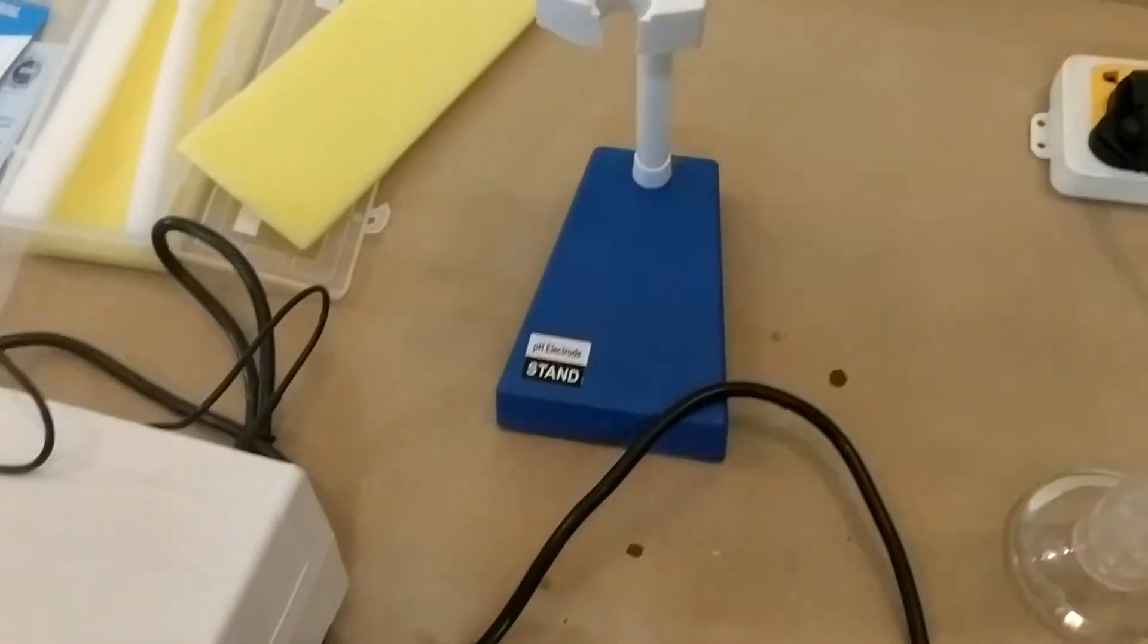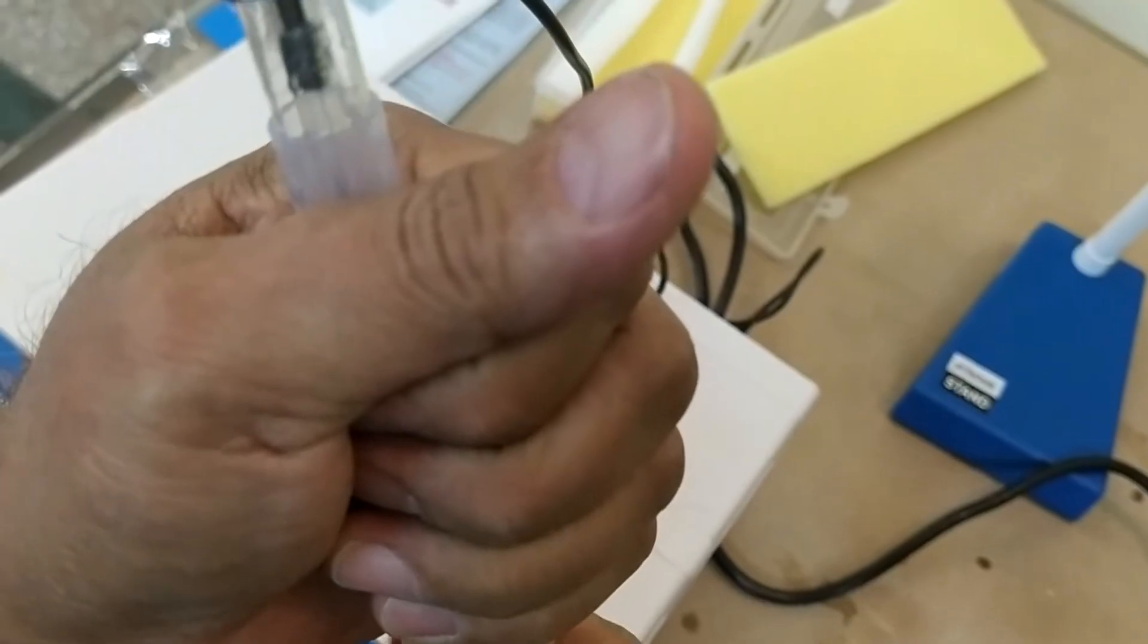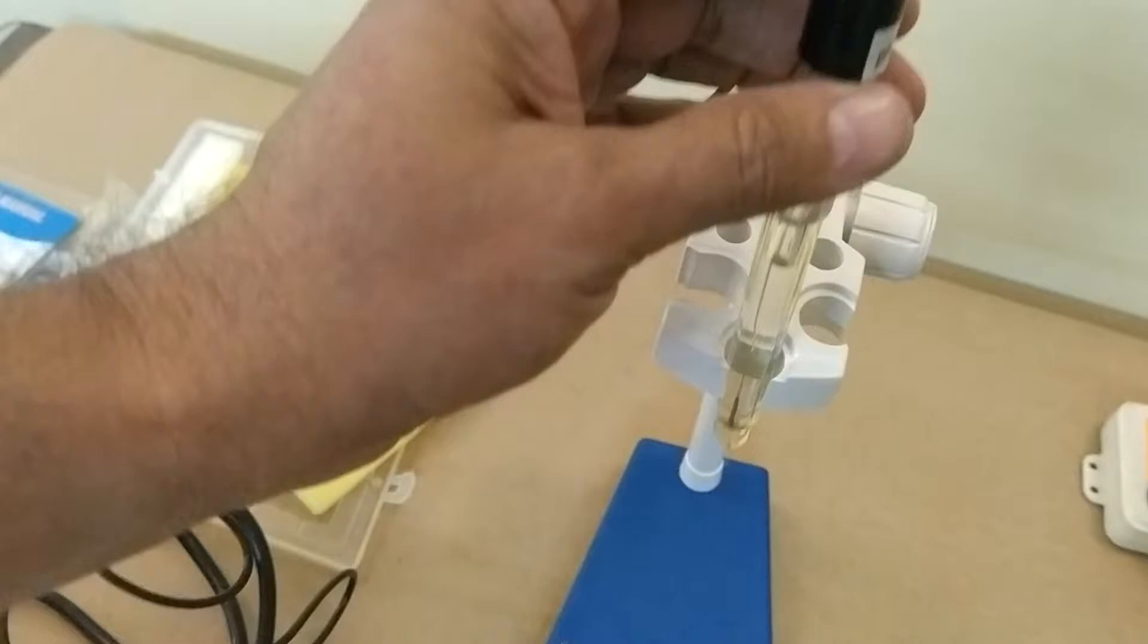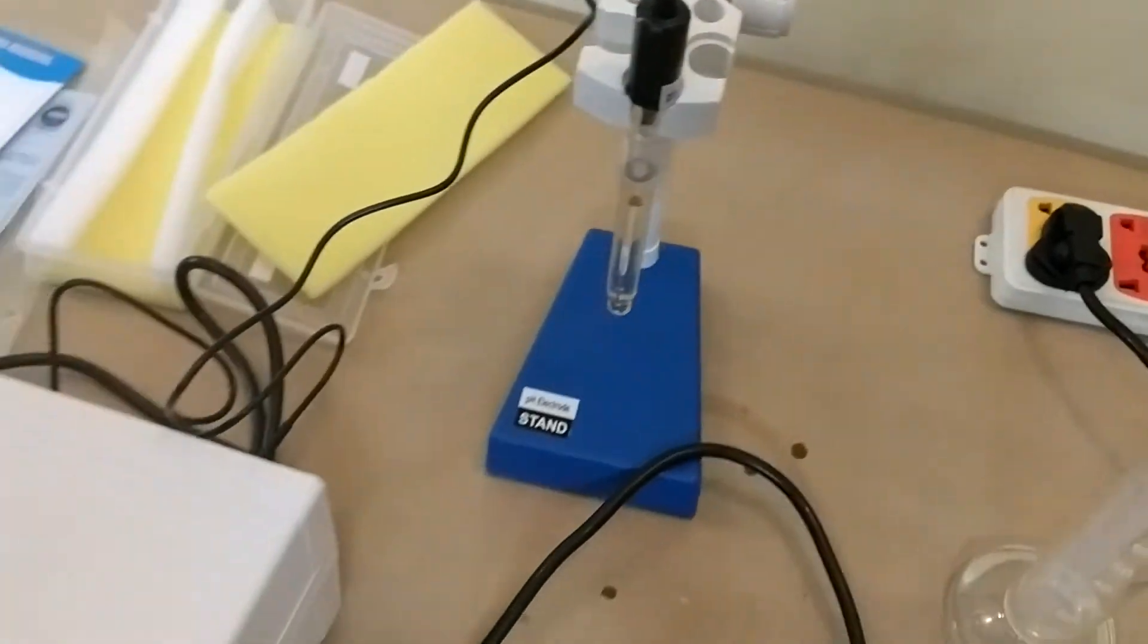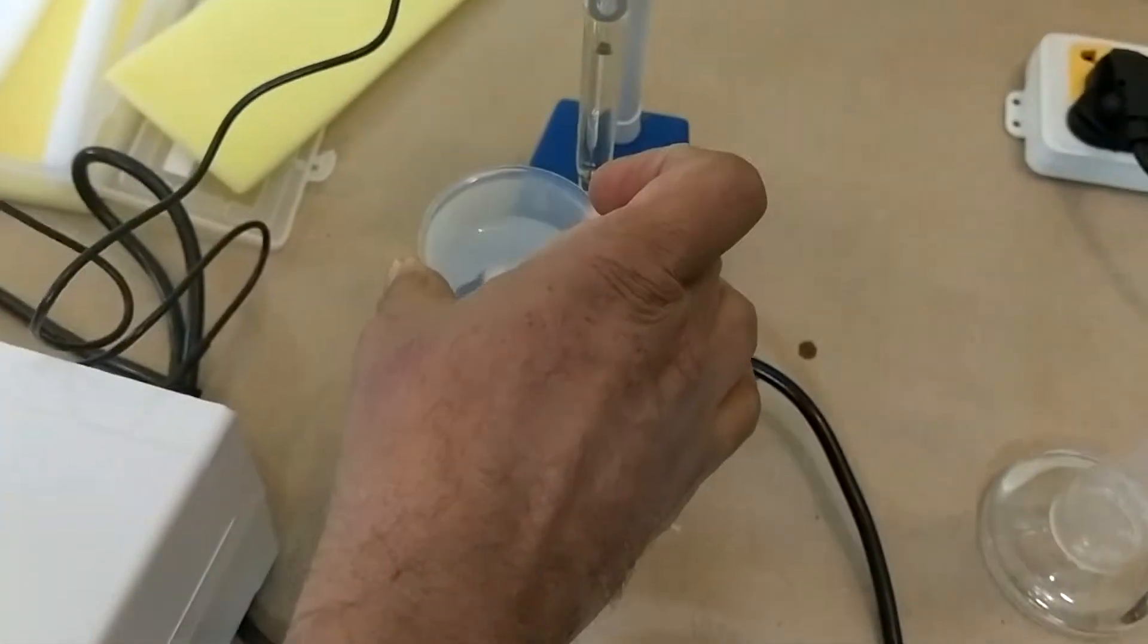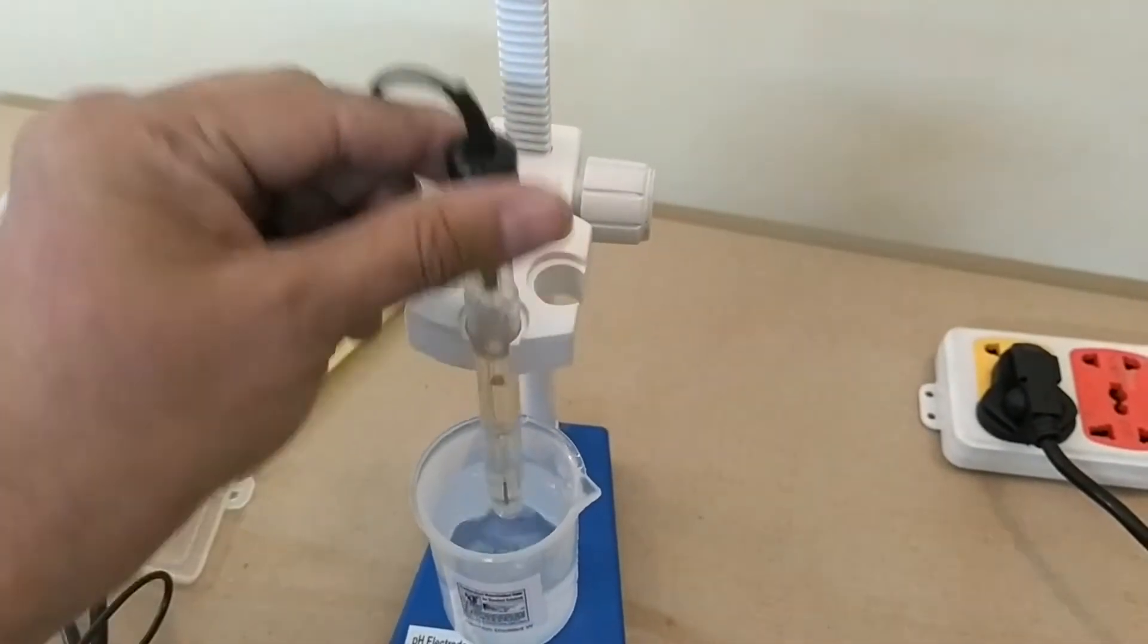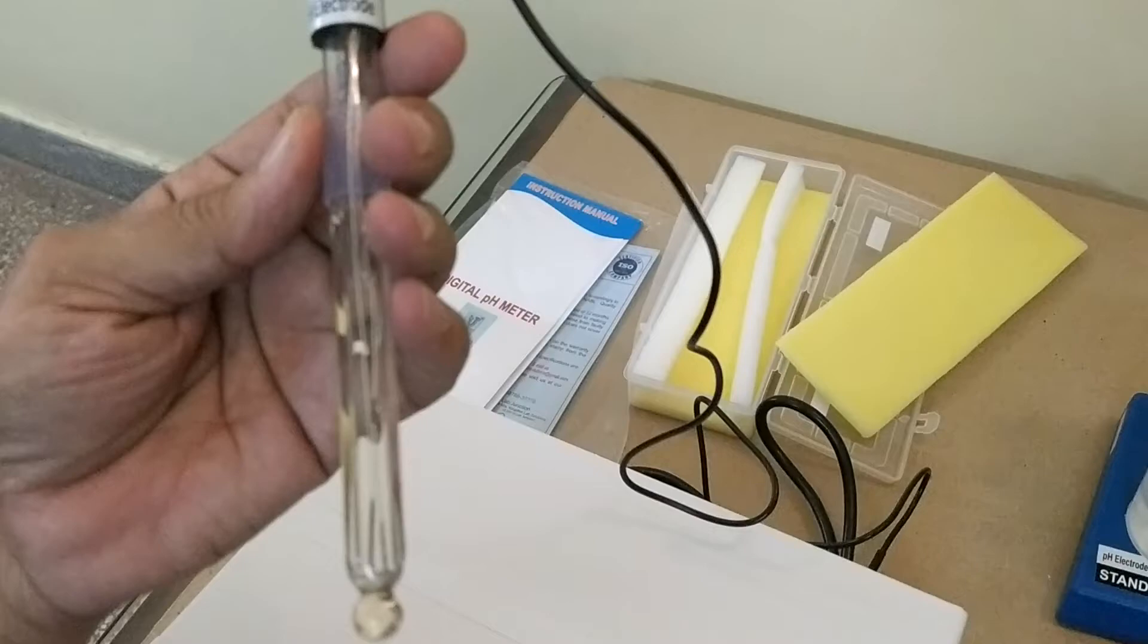How can you open the charger capsule of pH electrode? Always open this. Now you can stand in this way. Always dip pH electrode in 7 pH buffer solution or distilled water like this. Always wet pH electrode in 7 pH buffer solution or distilled water.